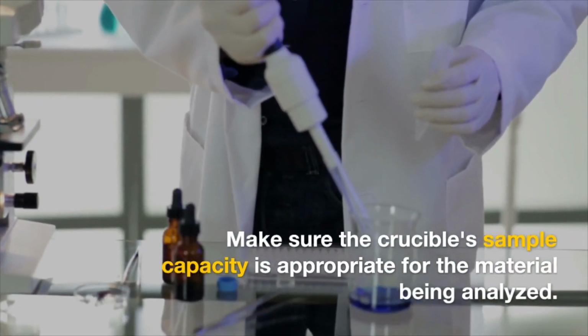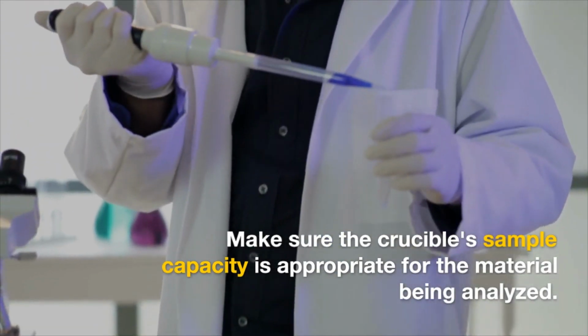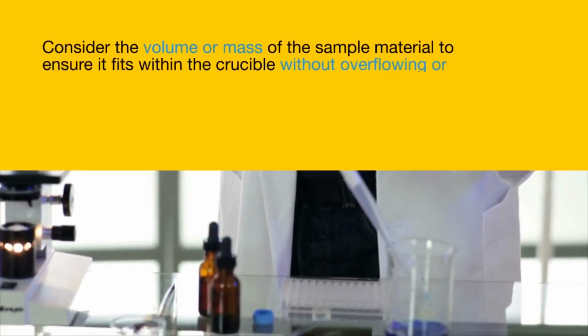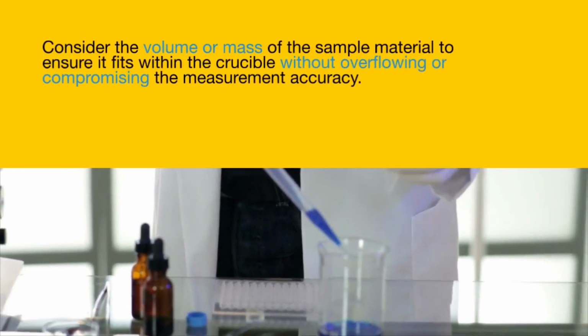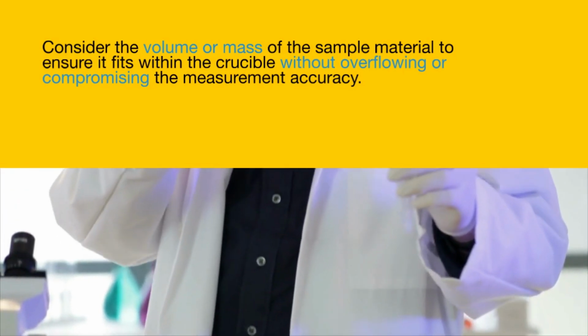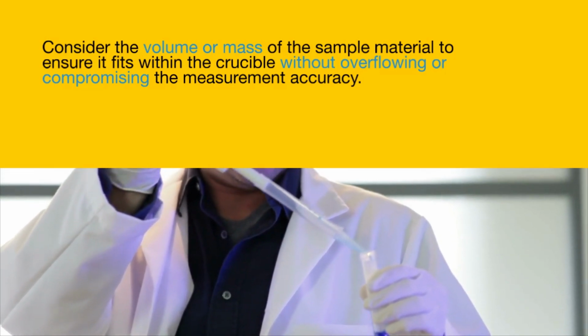The crucible's sample capacity should be appropriate for the material available for analysis. Consider the volume or mass of the sample material to ensure it fits within the crucible without overflowing or compromising the measurement accuracy. Overloading the crucible can lead to inaccurate results and potential safety hazards.